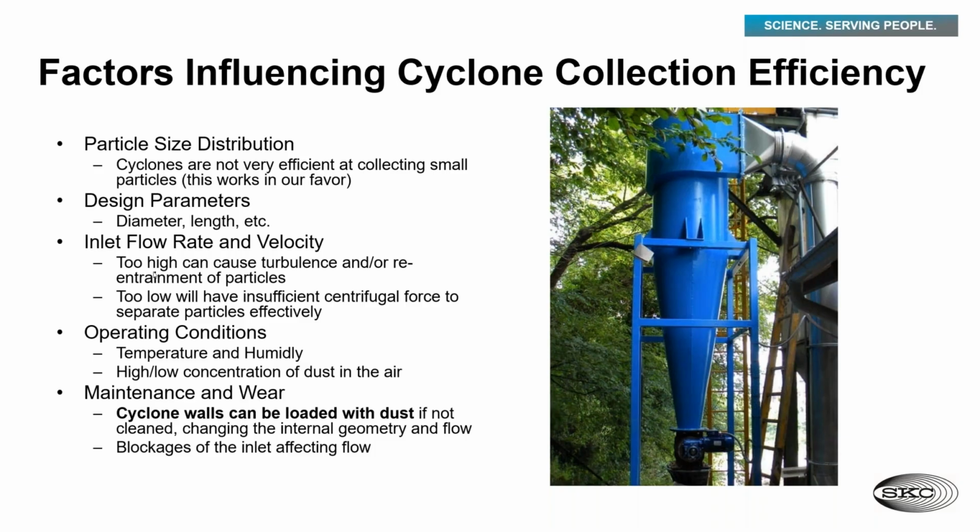And so keep in mind, especially with the cyclones that we're talking about, they require some additional maintenance. The inside of the cyclones can become coated with a fine layer of dust that will continue to build up over time if it is not cleaned out. And what that's doing is effectively reducing the size of the internal diameter of that cyclone.